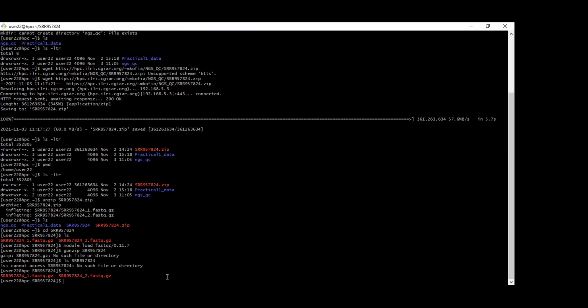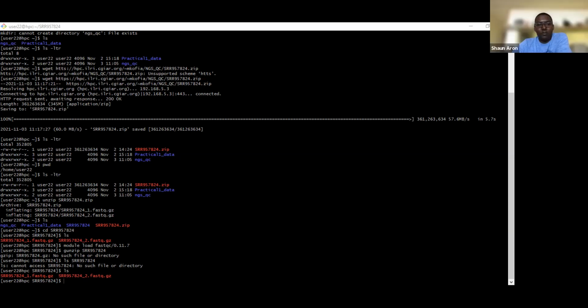The next step is to view the fastqc files. This is the end, is it? What should I do so that I can see the HTML file? Well, you haven't really got to that step yet. You first need to run fastqc on the data set.